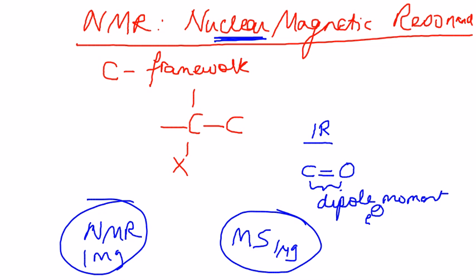And as we go forward, you will see how and what are the possible techniques within NMR that are available. The closest you can perhaps envision in terms of the health-related field is the MRI, magnetic resonance imaging, which is based on the same principle as NMR. So NMR is sort of the mothership for that technique.